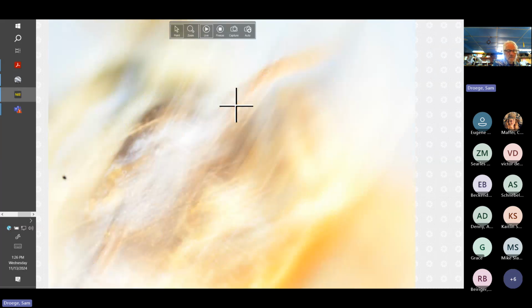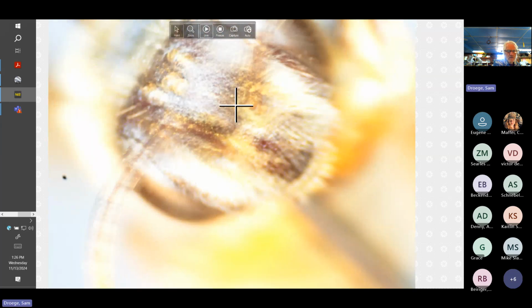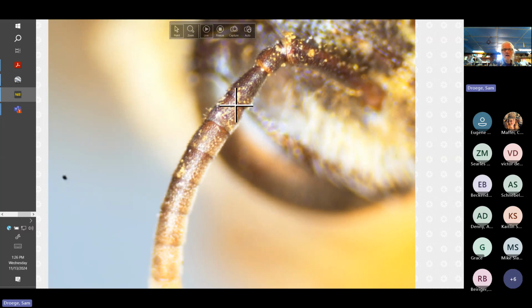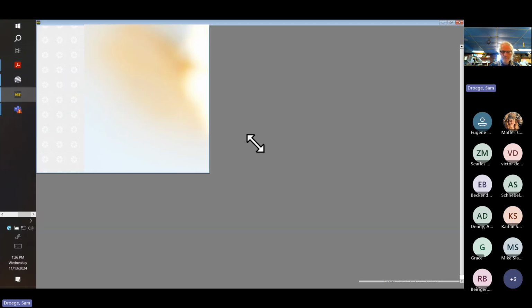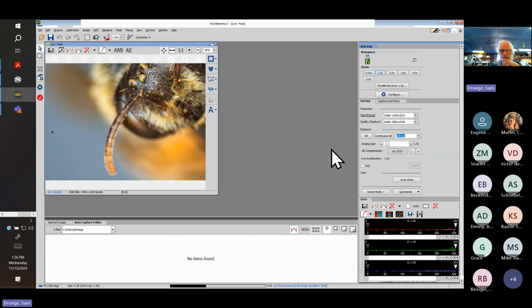But let's take a look at the other segment, which might offer more. This is why holding it in your hand is helpful, because you can angle things back and forth, and none of these things are exact. Okay, pedicel, F1, F2. Here the lengthiness, that is, this axis is greater than that axis, is a lot clearer. So there's a positive feature. I'm going to go back down in my light level. Let's go to 100.